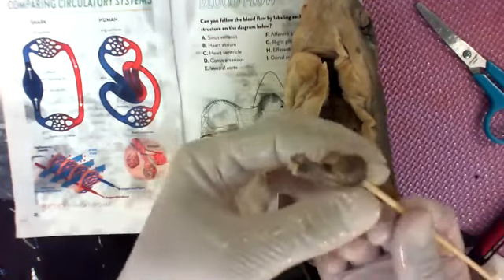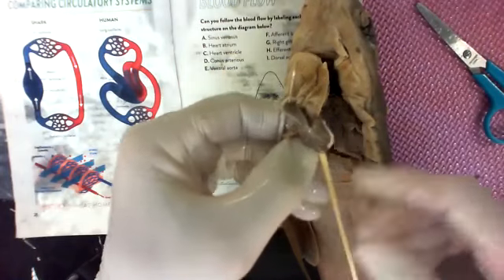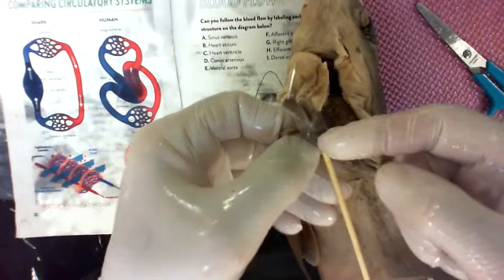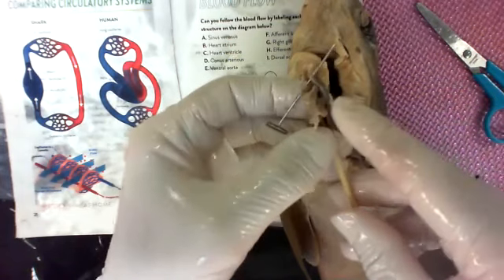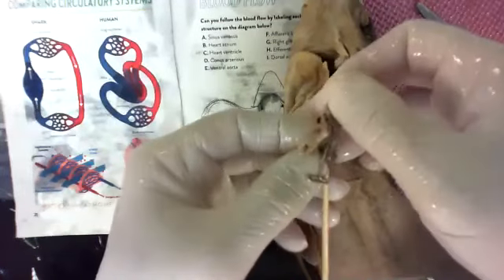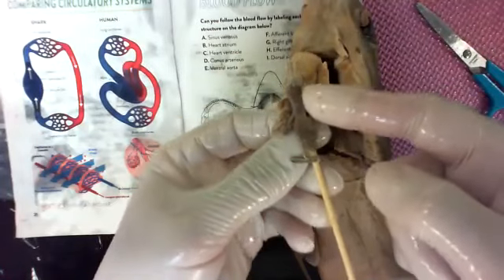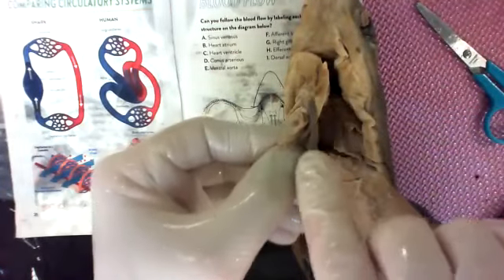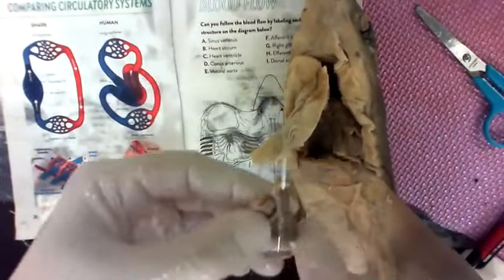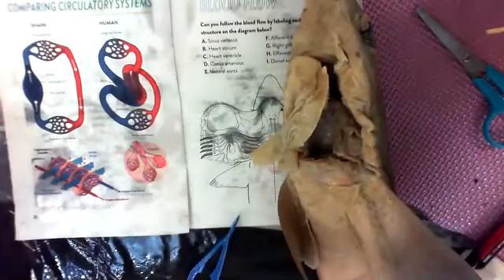I can feel where the path of blood would come from. See it right there? That's the atria. It comes down into the ventricle, and then the ventricle, when it squeezes, pushes it up. This is kind of flip-flopped. Should be in here. There we go. So it follows the path of the wood stick down from the atria, ventricle, and then follows the metal pen from the ventricle out to the aorta. Pretty cool. All right, I have a pin, so I'm going to count that one, stick it back in.